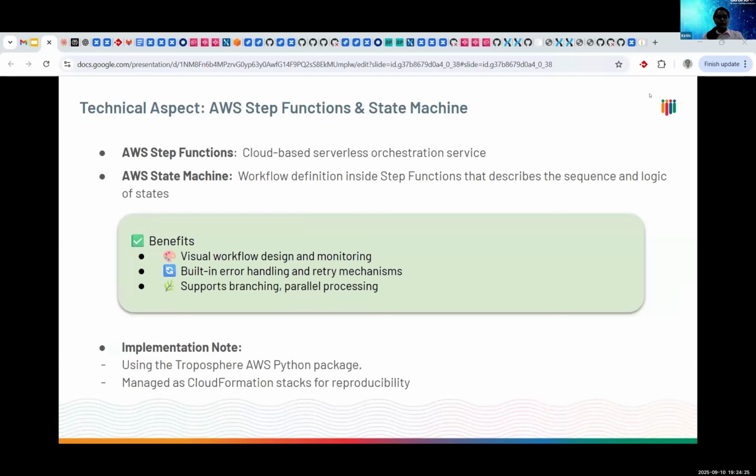Because genomic data processing isn't a single step, right? It includes a series of checks, conversions, analysis, transfers, etc. And with Step Functions, we can trigger the right step at the right time. We can even visually monitor the process in real time. And we can let the system handle all the retries, delays, or ways to handle failures without any manual intervention. So these Step Functions are what make a pipeline a little more automated, a little more robust and transparent.